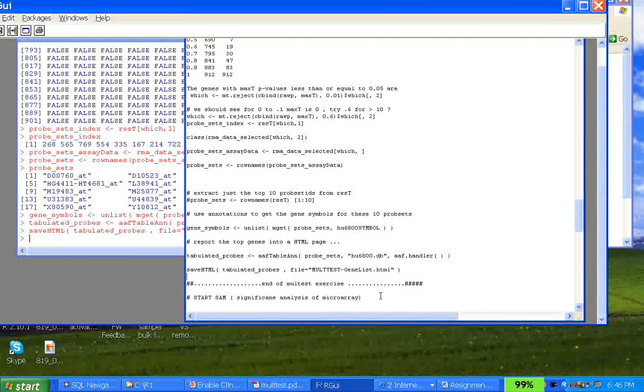So whatever I'm showing you in the preparation or whatever you're reading in your textbook is done on the ALL dataset. But when I'm asking you the homework, I'm not asking you to use the ALL dataset. You have your 16 CEL files. Those are what you're concerned with. You have no concern with the ALL dataset. That's just for example. So when you're trying to import the ALL dataset and you're stuck there, my question is, why are you bothered about the ALL dataset for your homework? That's just the dataset, right?